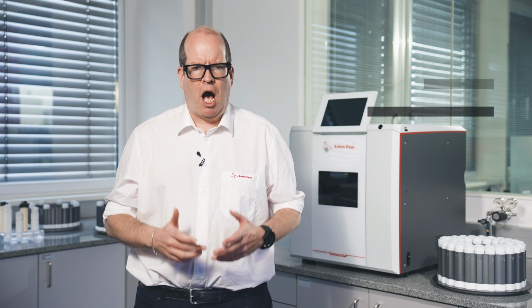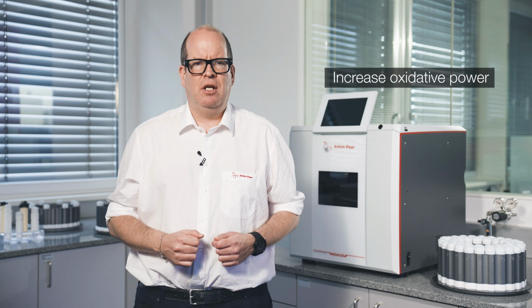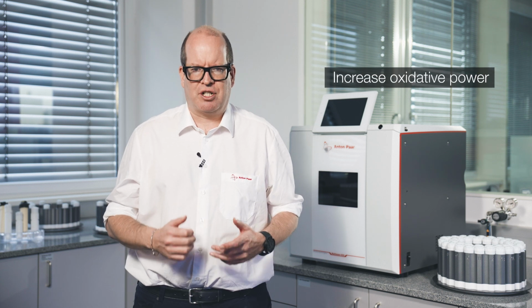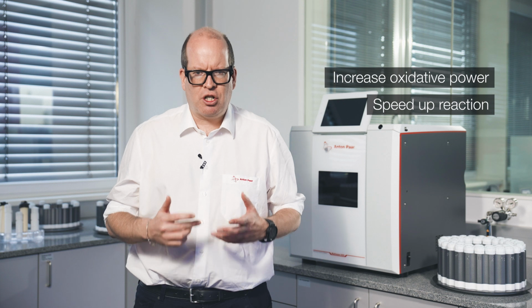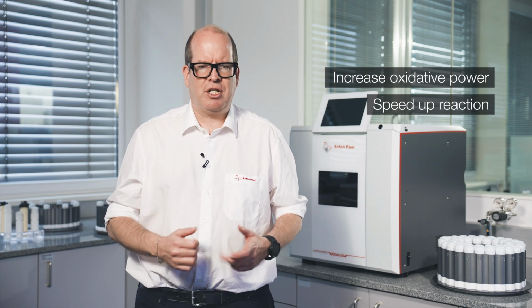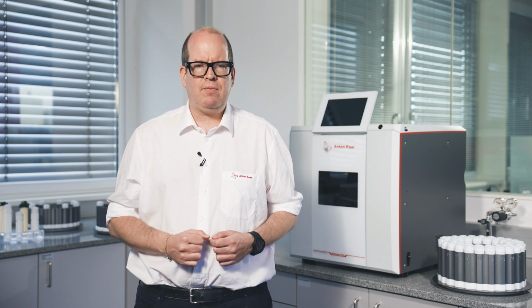There are 2 main reasons. First, a high temperature increases the oxidative power of the acids and improves the digestion and dissolution. Second, the high temperature decreases the total digestion time. Different samples require different temperatures for complete digestion.